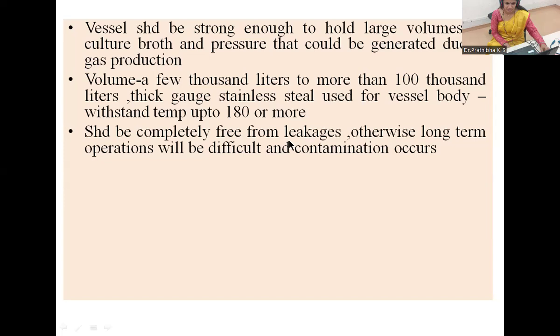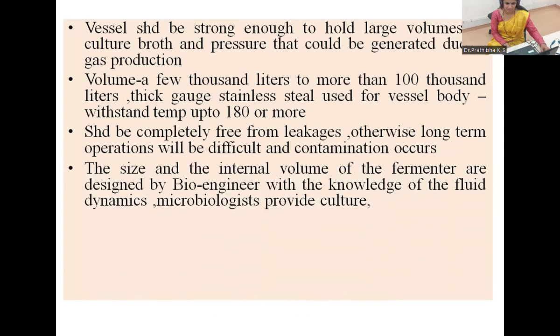And the vessel should be completely free from any kind of leakage, otherwise long-term operations will be difficult, and due to leakages, chances of contamination will be there. That's why there should not be any kind of leakage.